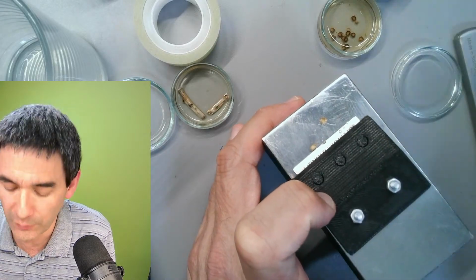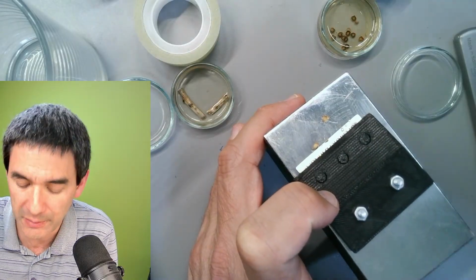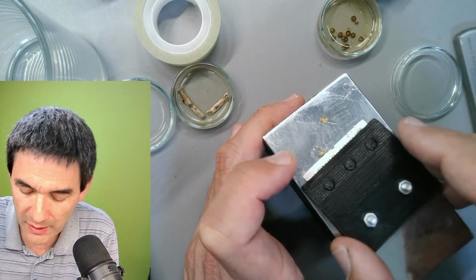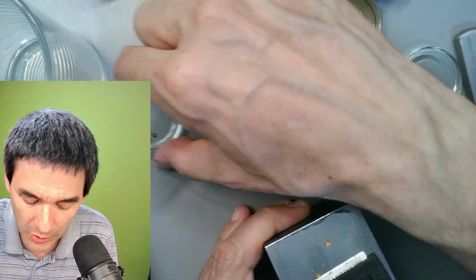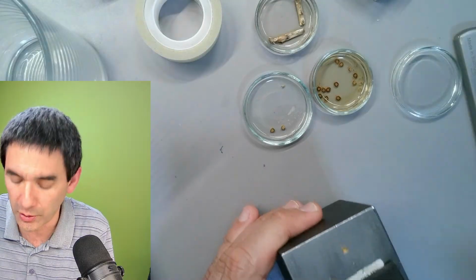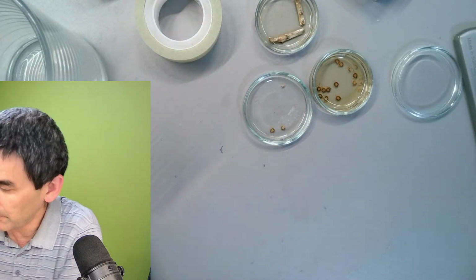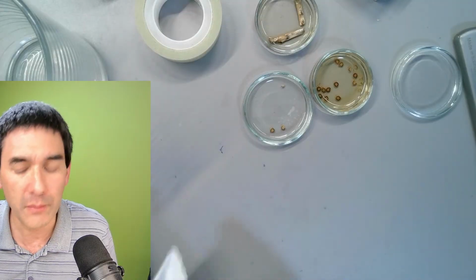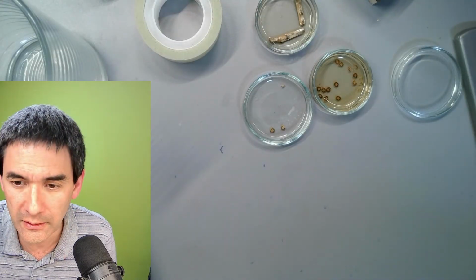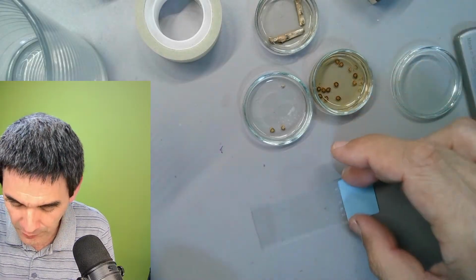Considering the fact that the wood is actually, or was quite hard, I'm quite happy that it can be cut at all, right? And then I put it into water, and that's basically where we are right now, okay? So this is in water. And I just want to show this to you now as well. We're just going to make a little, how do you call this, slide, again, as before.